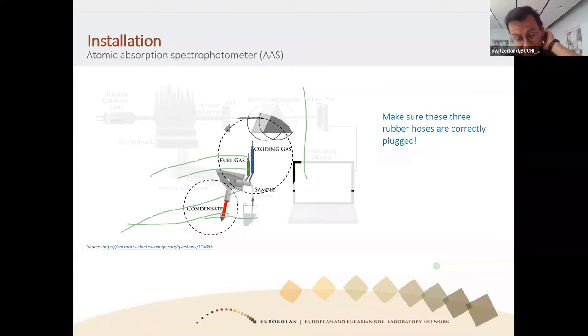Nitrous oxide, I think that is really special. Basically, if you notice that you are experiencing some euphoria during the operation of the instrument, then be careful, because this gas is exactly what it does. It causes a feeling of euphoria. Nitrous oxide is also known as laughing gas. So if you start enjoying your analysis too much, then be careful, because this is supposed to be boring. So careful with that.